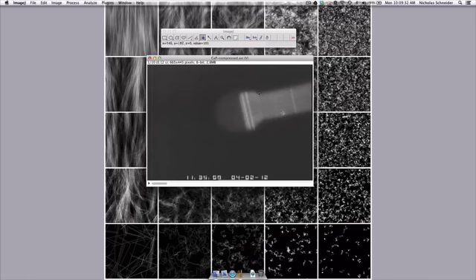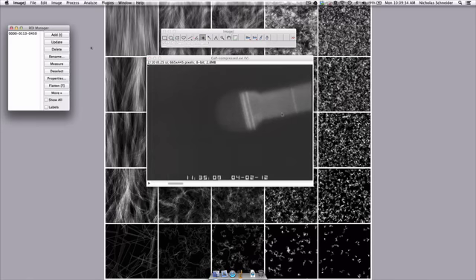So I'll click on it, hit the keyboard shortcut of A, and we'll see that that brings up the region of interest manager, and it logs the point that we selected.